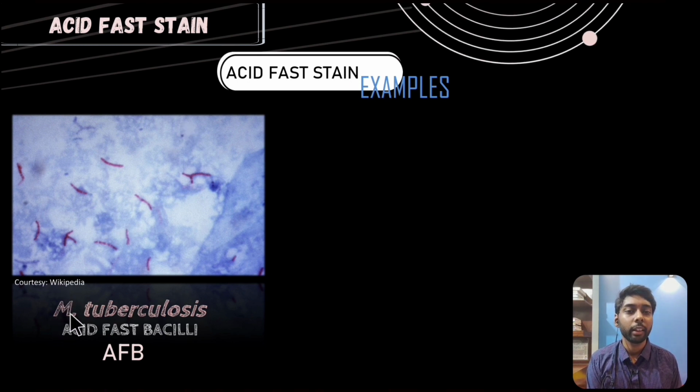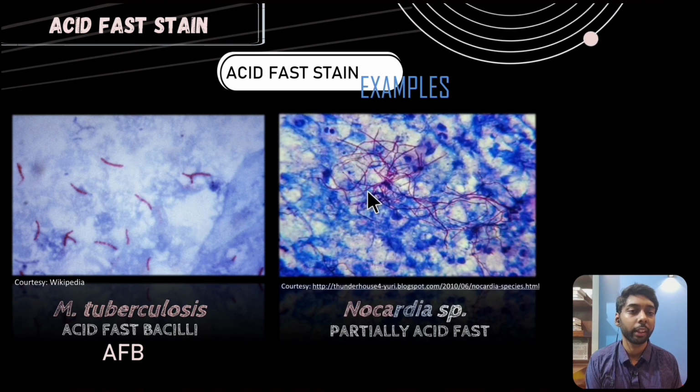Also to mention that Mycobacterium tuberculosis are commonly known as acid-fast bacilli, or AFB in short. So that's something you will see being mentioned in your books over and over again.